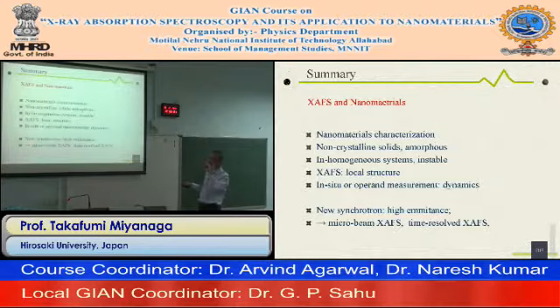So it's possible to do microbeam EXAFS measurement, and with coherent and short pulsed X-rays it's possible to do time-resolved measurement.